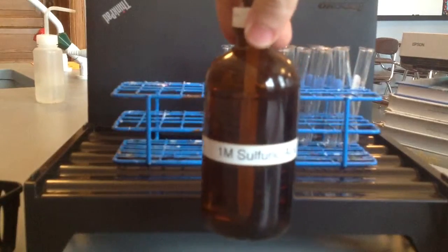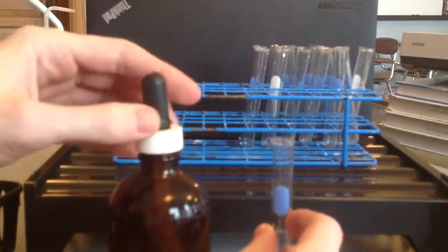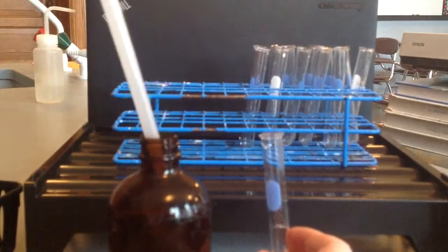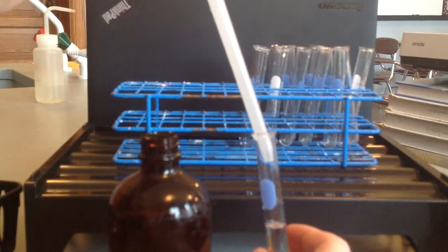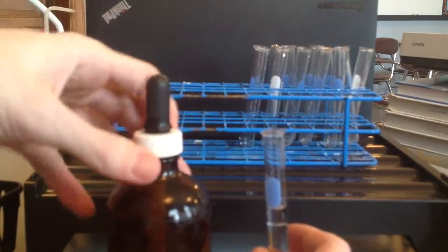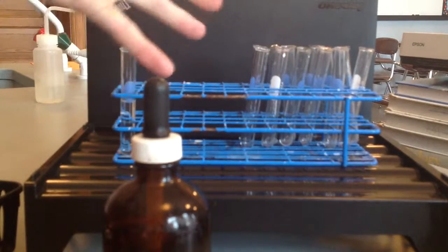So this is the sulfuric acid. We're going to go ahead and add some of that to a test tube. It says about 2 to 3 mils. Okay, so there is our sulfuric acid. I'm just going to put these in order from left to right for all of the reactions. So this will be the first one, and then so on as we go across the way.